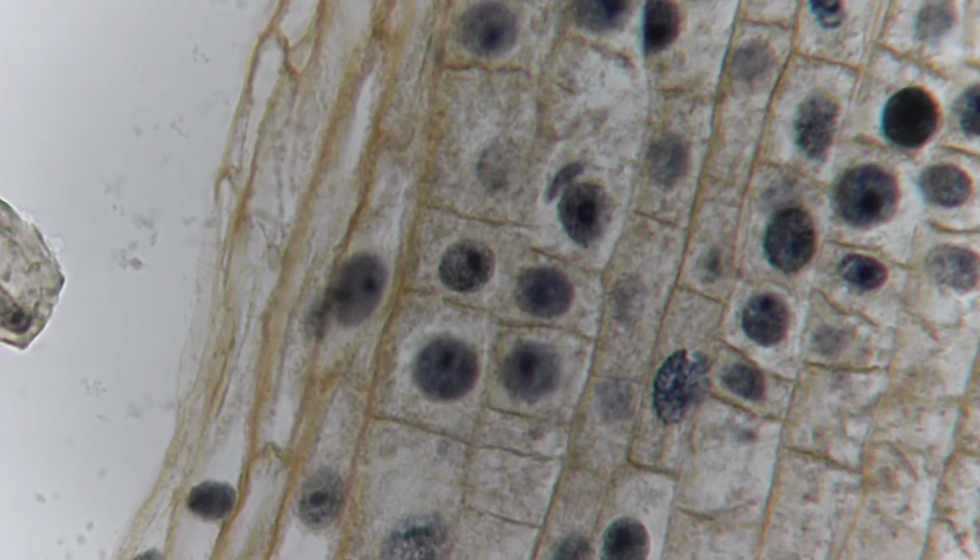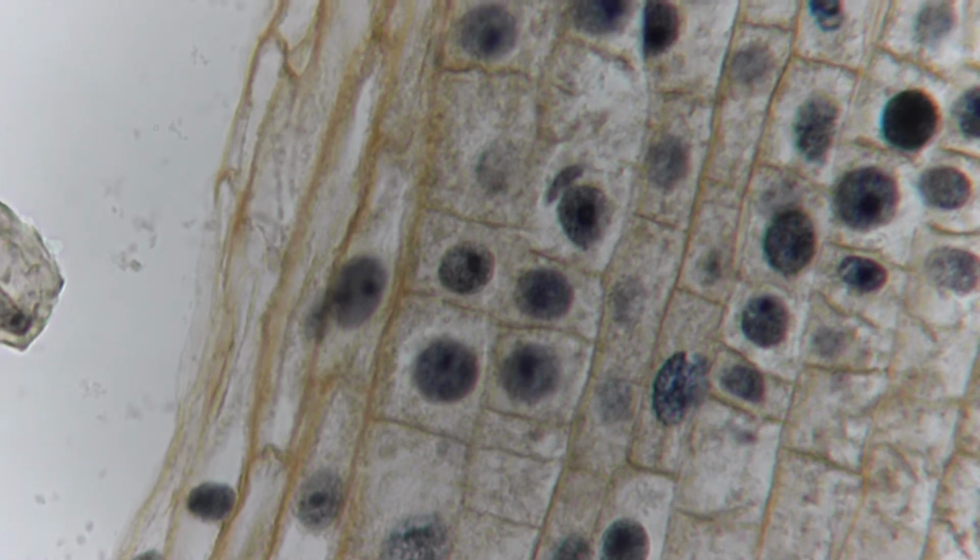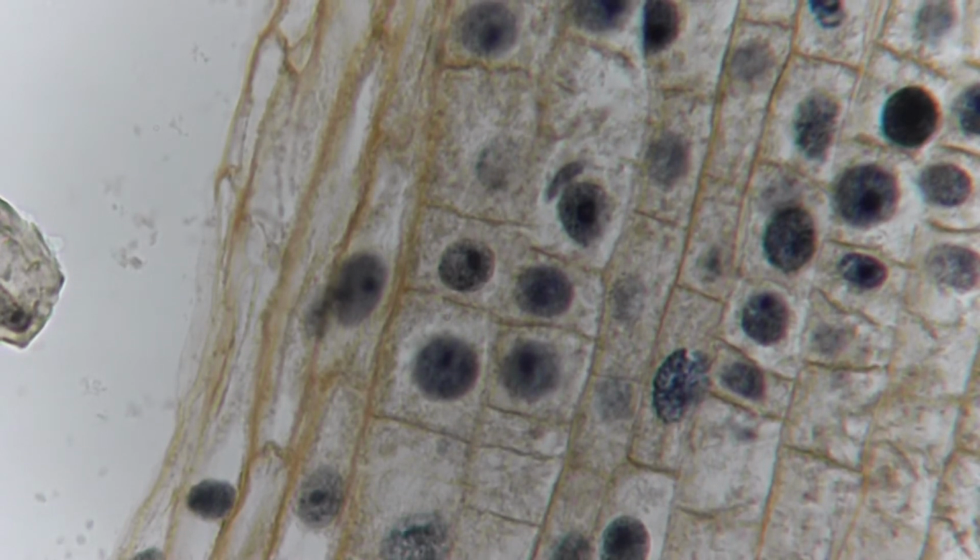And so I'll be making the drawings on the board later, but right now on the screen, you'll see that there's 4 cells right in the center, kind of making up a square of 4. Well, those are interphase. They're not actually undergoing mitosis, so they're in between divisions. And if you look at procedure 1, I'm going to point out what all these parts are. We'll be labeling them later on the drawing. But you'll see that they all have a border, kind of a rectangular or square border around. That outside is the cell wall.